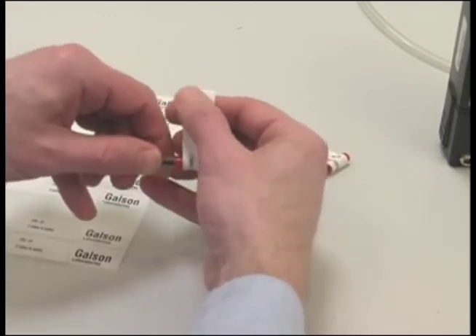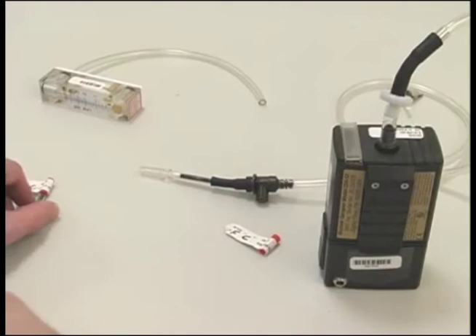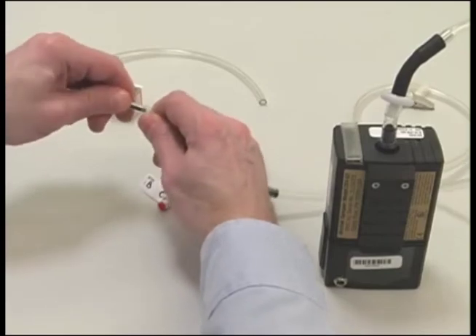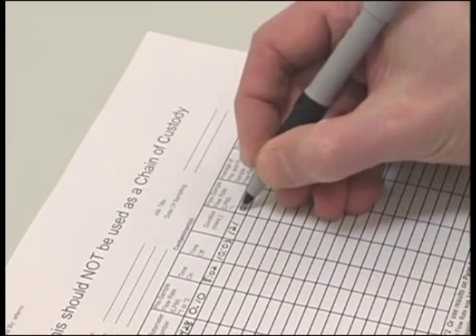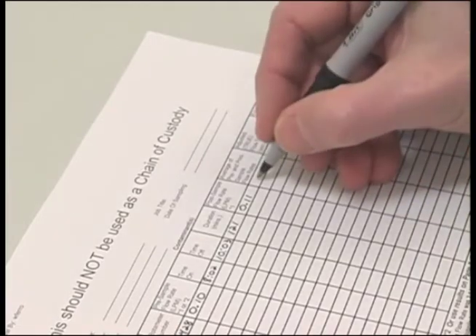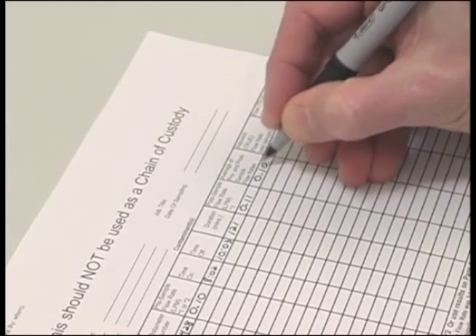Label the sorbent tubes. A post calibration must be performed on the pump. Perform the post calibration the same way you did the pre calibration, using the marked calibration sorbent tubes, but do not make any set screw adjustments. Just record the flow rate on the pump calibration sheet. The pre and post rates should be within 10% of each other. If they are, average the flow rates to determine the flow rate to be used to calculate the air volume.